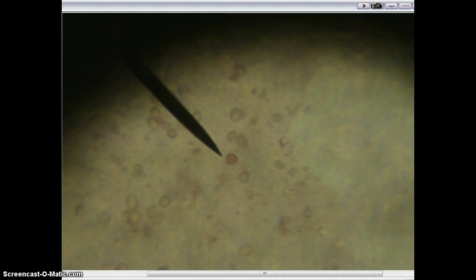Now I'm going to pause this, and then we're going to look at some dead yeast cells to see if they are pinkish or reddish in color.